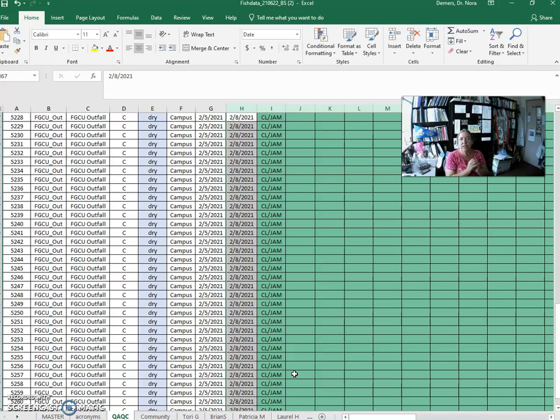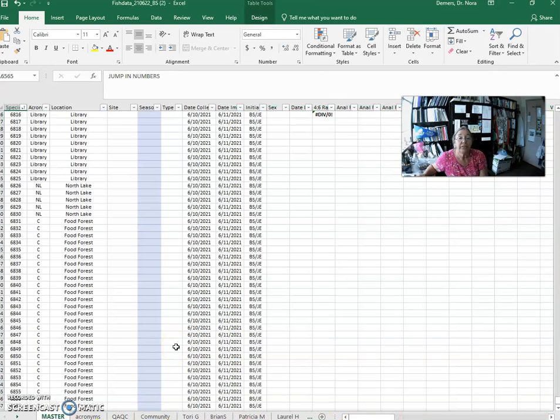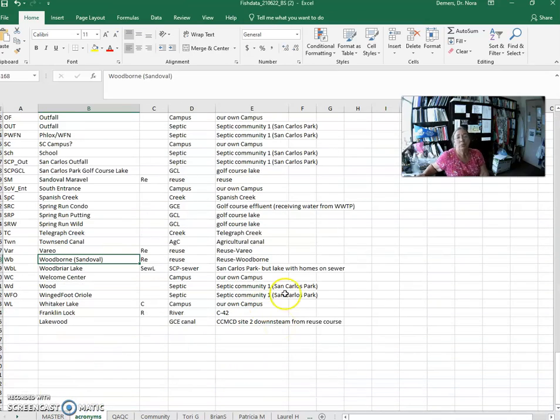The other error that we often have is if the image is not very good. And so that's how we want you to mark on that master sheet. Make a note if you've got a fish image that doesn't look very good, then mark that on there so that we know we might even want to delete that data. And we are going to have 2 people measuring each fish so that we can check ourselves on how well we're doing it and make sure they all ended up in the right spot on the spreadsheet.